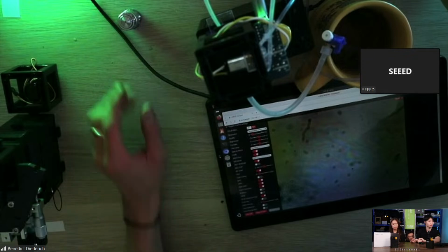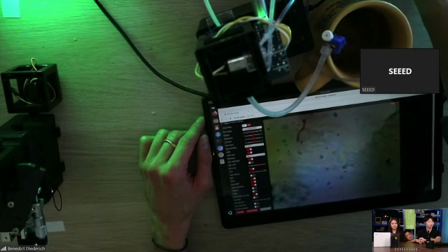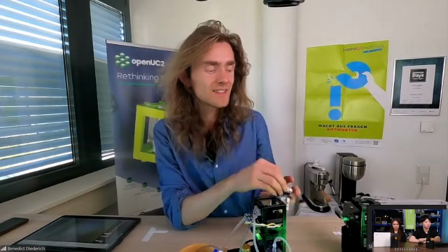Okay, but just to give you an impression, the optics, of course, is backed by electronics, and so the idea of this whole system is now to make the optics talk to the electronics somehow, so that we have, in the end, arbitrarily complicated systems that are based on optics and also on electronics, and then you can combine the two, for example, to have computational optics. And since there's a huge gap between a Raspberry Pi and these USB microscopes, or actually also very fancy microscopes, I think UC2 is the perfect spot for you to get started with any kinds of optics.